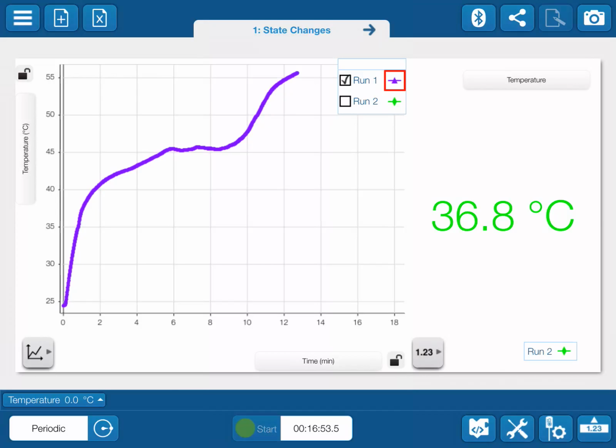This is sample data for the lauric acid lab. What the graph basically looks like is you see a very steep slope from 0 minutes to almost 2 minutes. And that should be very common. So that's when you first start heating the lauric acid in the hot water.